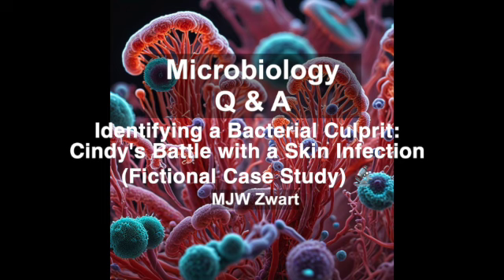So how did they approach Cindy's sample with these limited tools? Well, they began with a basic technique known as a wet mount. Okay, I'm vaguely familiar with that. It involves placing a drop of the sample suspended in water onto a glass slide and then covering it with a thin cover slip before viewing it under a microscope. Yeah, I remember doing that in high school biology. But I have a feeling it's not as simple when you're dealing with bacteria.